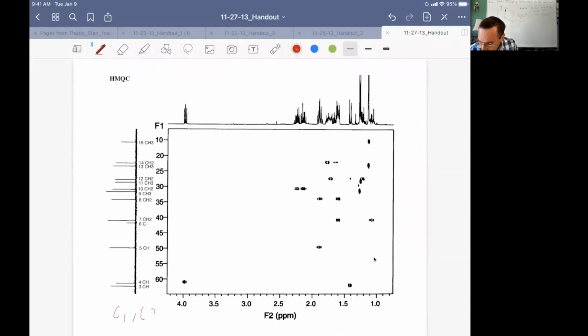C1, C2, they're about 80 parts per million. So they're way downfield. And since they're quaternary, and since we have no alcohol but the molecule has an oxygen, those are carbons connected to the oxygen. So it's going to be C1, O, C2 in some way of connection. But let's look at our HSQC, our HMQC, and we can see just what a bloody mess this is.